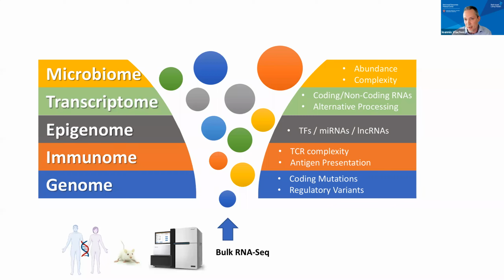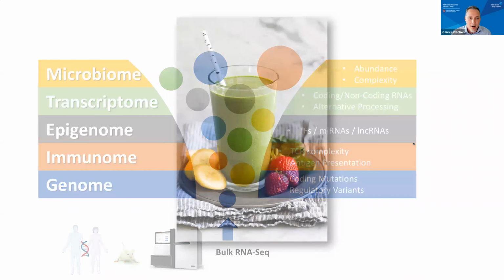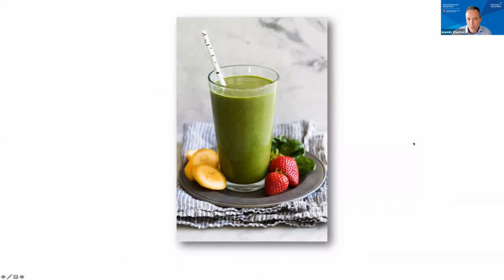Data are readily available. It's cost effective. It's a very rich modality. The methods for data analysis are very robust thanks to tremendous efforts from the community. It's a very mature platform and it's continuously improving. However, there's always a twist. Despite the incredible derived information, it's still bulk, and the lack of granularity imposes limitations on the questions that you can ask.